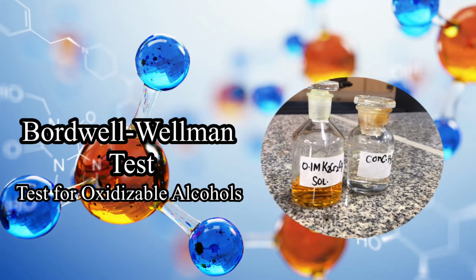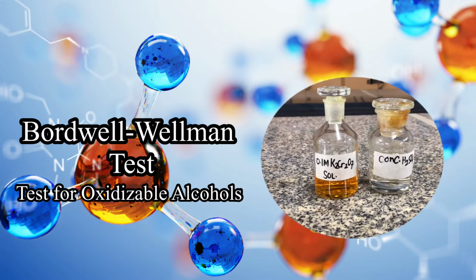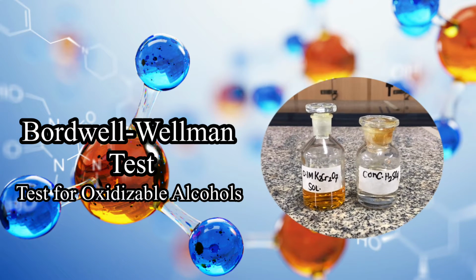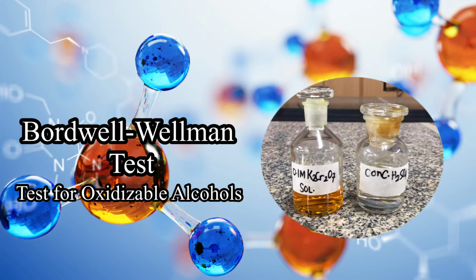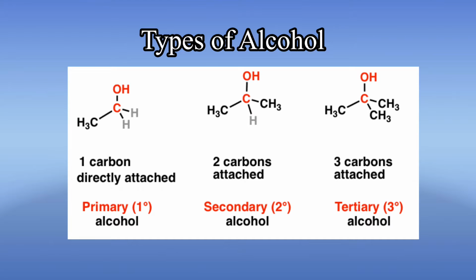The first test I'm gonna show you is the Bordwell-Wellman test, which is used to determine what type of alcohol is oxidizable. The oxidizing agent for these tests is potassium dichromate solution with concentrated sulfuric acid. Recall that alcohols can be classified as primary, secondary, or tertiary based on the number of carbons directly attached to the carbon bonded to the hydroxyl group. The Bordwell-Wellman test determines which among these alcohols can be oxidized.